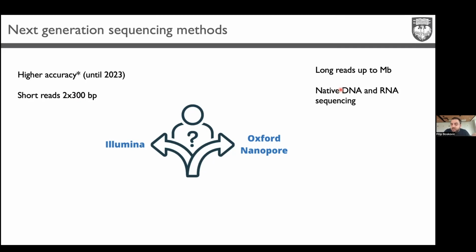You can save the data until someone publishes an algorithm and you can implement it in your pipeline. So that means that you can do epigenetic and epitranscriptome modification detection directly without any chemical assays. You don't need to convert, do reverse transcription, or run controls. So you don't need control for sequencing of modifications that are, of course, available.